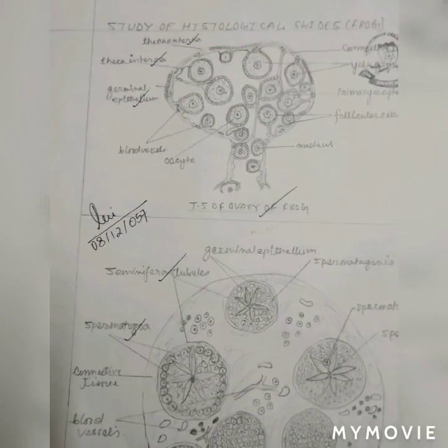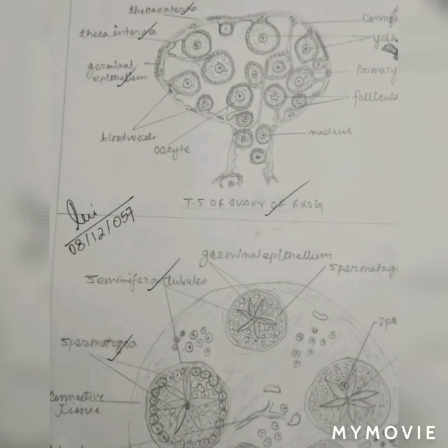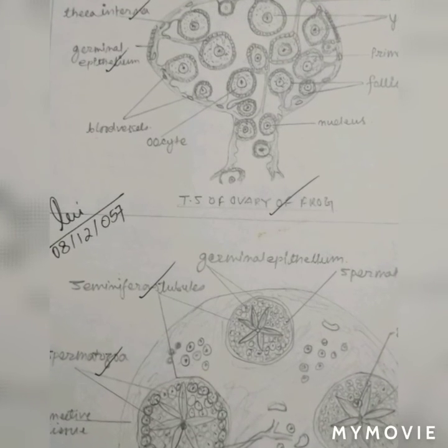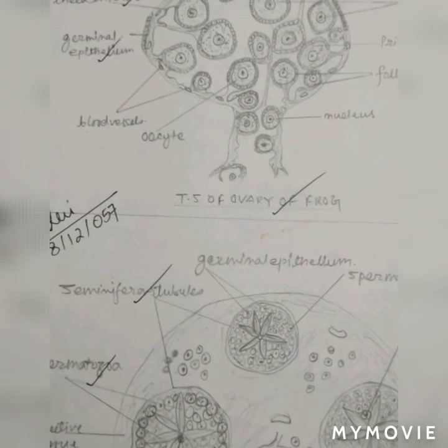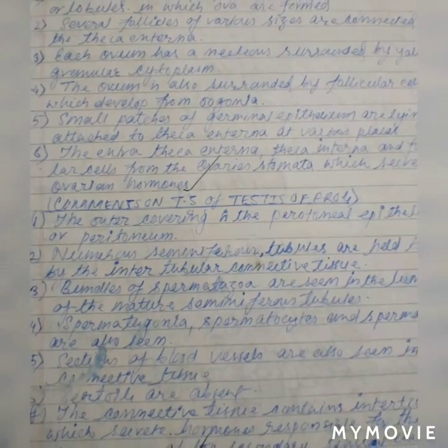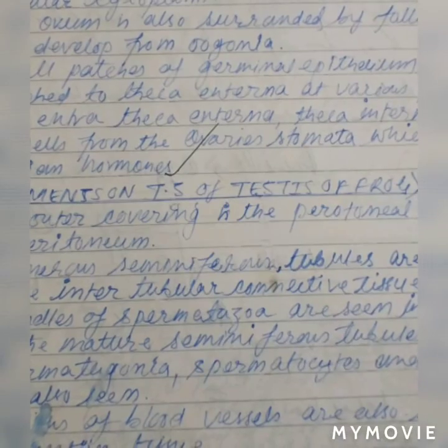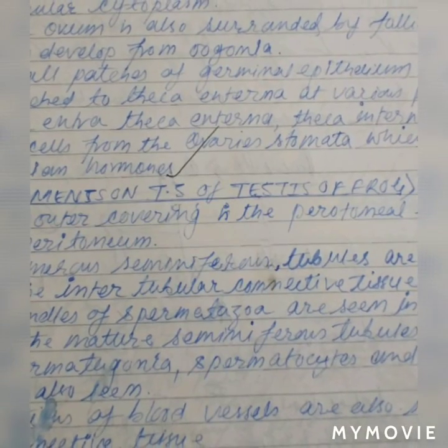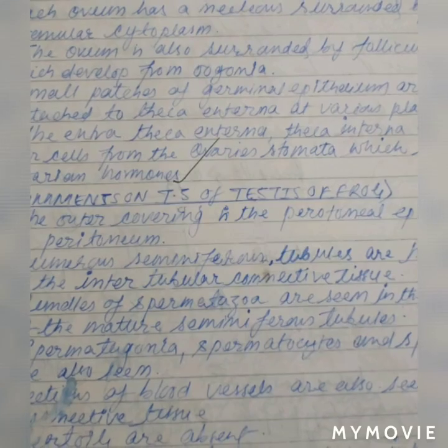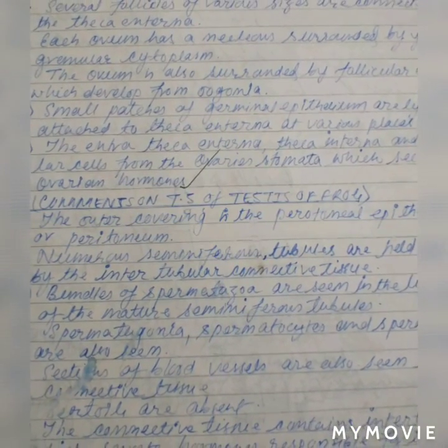Spermatogonia, spermatocytes, and spermatids are also seen. Sections of blood vessels are also seen in the connective tissue. Sertoli cells are absent. The connective tissue contains interstitial cells which secrete hormones responsible for the appearance of the secondary sexual characters.